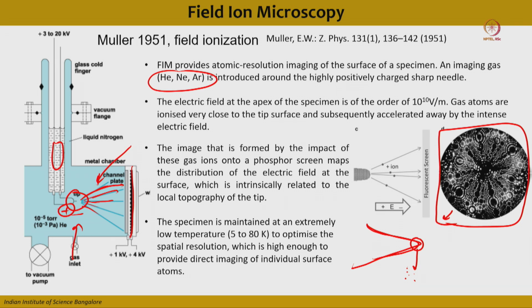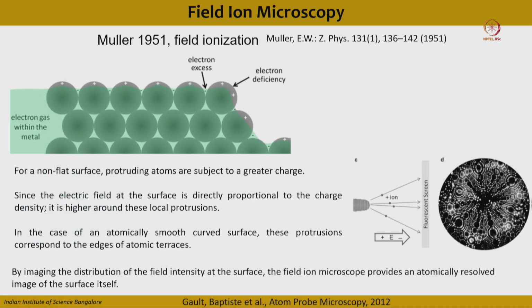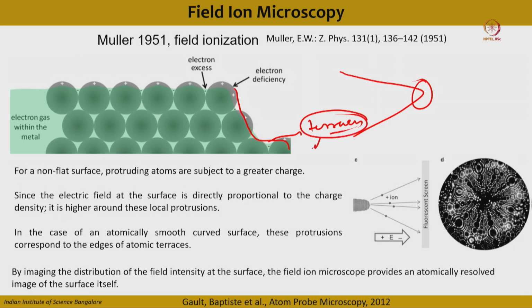As we also explained, these imaging gas ions which get ionized on the tip form this FIM image. We also described the formation of these circular features, and they have certain orientations, correct. And if you see an atom probe tip and zoom in on this region, you can see that these atoms have certain terraces. These are called atomic terraces, and these are related to the crystallography, fine.